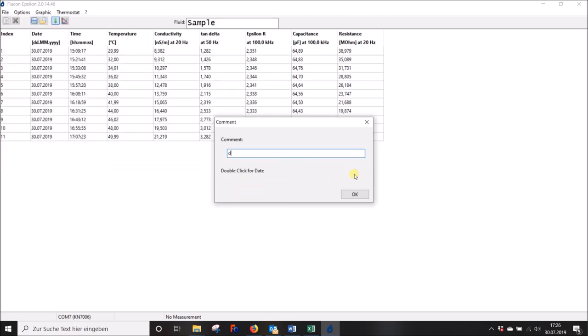After clicking on Save, you are given the opportunity to add a comment which may include further information on your sample or measurement.